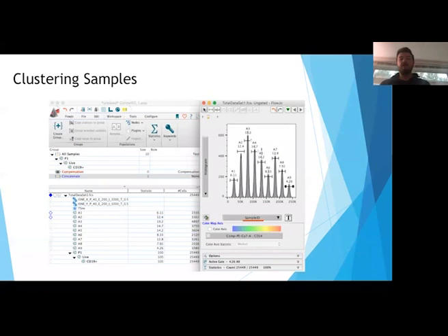Next, just to cover probably one of the main use cases of t-SNE on a concatenated data file: people that want to investigate the t-SNE clustering by sample. As I mentioned, there's a sample ID parameter inserted into any concatenated data file, which allows us to gate out the various different samples. The order of these samples will be the order of the samples as they existed in your workspace to begin with. So in this case, the very first sample was sample A1, the second sample A2, and so on through A9. And I've gone ahead and drawn those gates here.